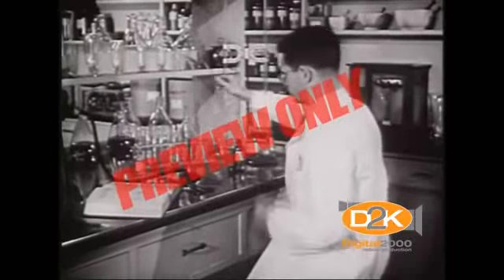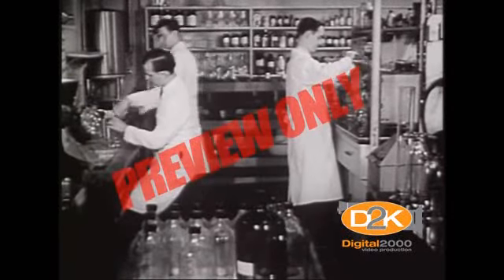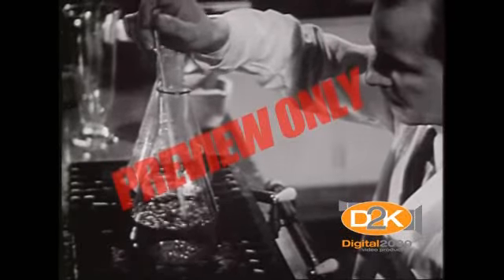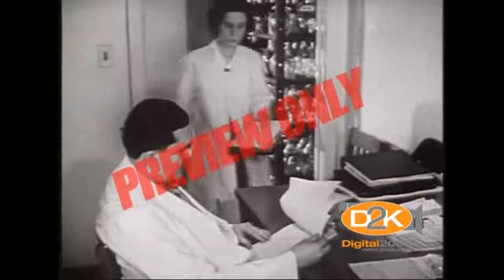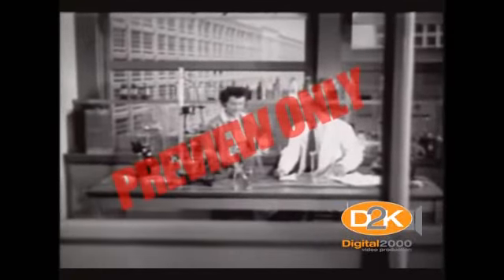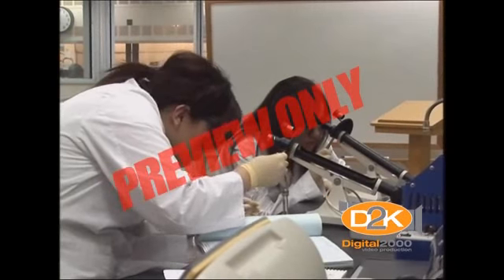In early laboratories, few items of personal protective equipment were available for use. Early movies show scientists and forensic chemists standing around Bunsen burners on office desks. Chemicals would be at a rolling boil in beakers sitting on a ring stand open to the room. Men are portrayed wearing street clothes, ladies wearing open-toed sandals with high heels. Quite often, both men and ladies were working in hazardous environments without wearing safety glasses or other PPE. This is not acceptable in today's working environment.